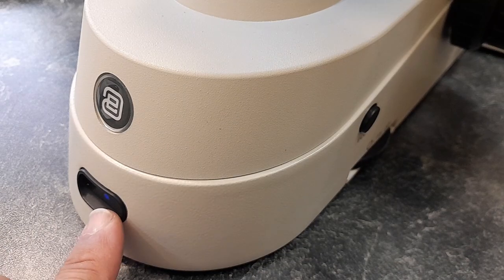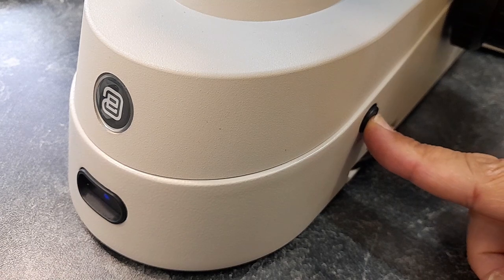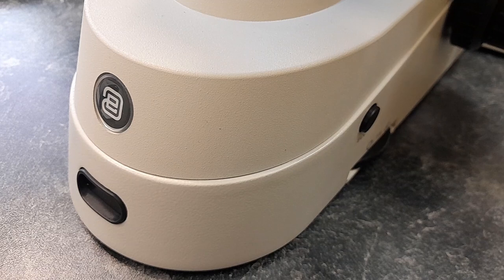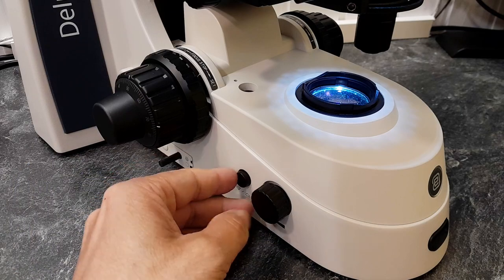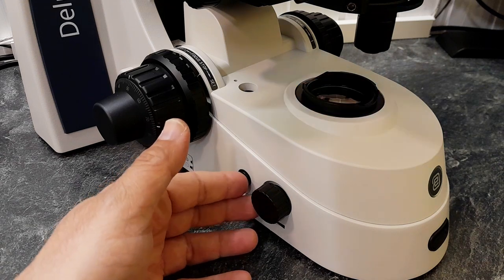The microscope will turn itself off if you're not using it for a certain amount of time. As a matter of fact, if you're leaving the microscope after a certain time it will switch itself off because there is a small sensor in the front that's called the eye care sensor and you can engage it or disengage it. You can switch this feature on and off as you need it but if you leave the microscope then after some time it will automatically switch itself off. However, there's also a second way how you can switch the microscope off and that is there is next to the light intensity control there is a small button and this button is there to switch between top light and bottom light. Now this microscope version over here does not have any top light but the switch can still be used and then in this case it switches off the main light lamp and this is a very quick way of quickly switching it off and you don't have to reach back in the back of the microscope for the main switch.